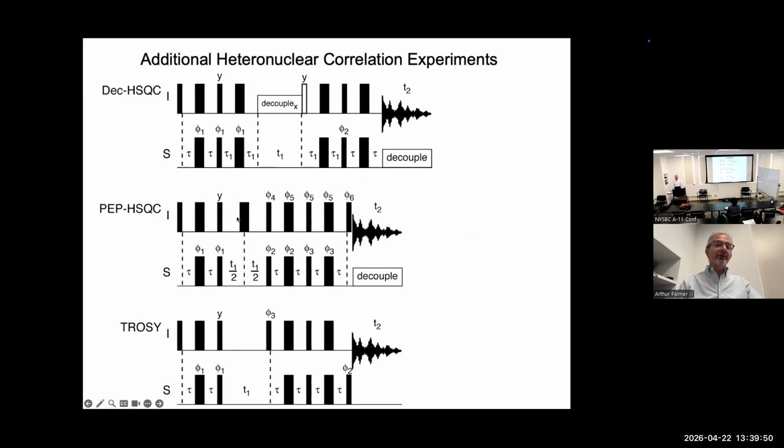in the first one, so here, let's just look at the second one, which is just like normal HSQC evolution. And you have a T1 period and a 180. So during that period, if the product operator was, say, IxSz, during the first T1/2, that's going to evolve under the scalar coupling. And you're going to have a mix of the in-phase and antiphase operator. And then you have the pulse, and that refocuses the coupling. So that mix goes back to the starting operator.